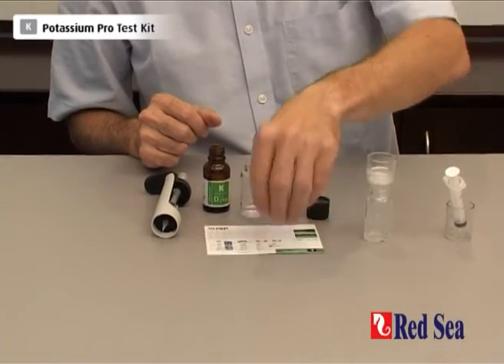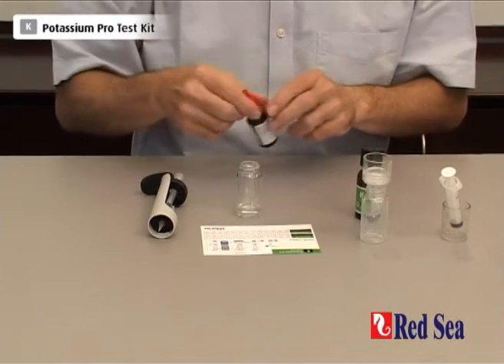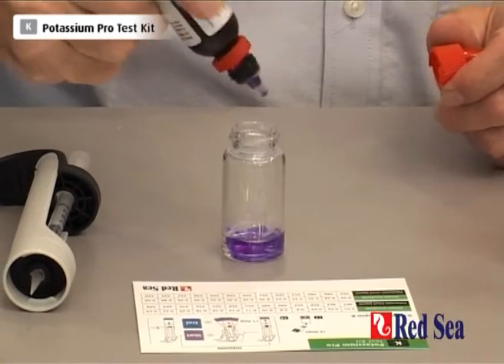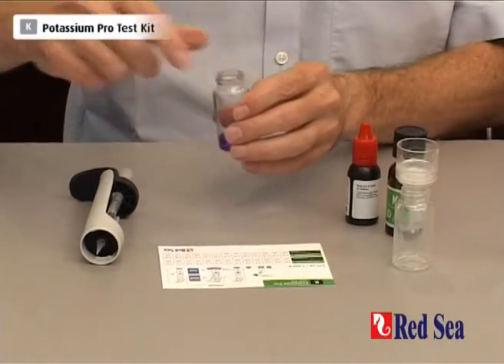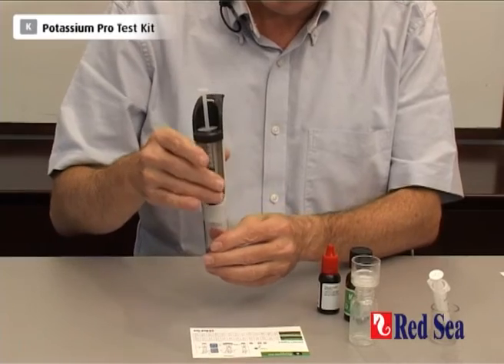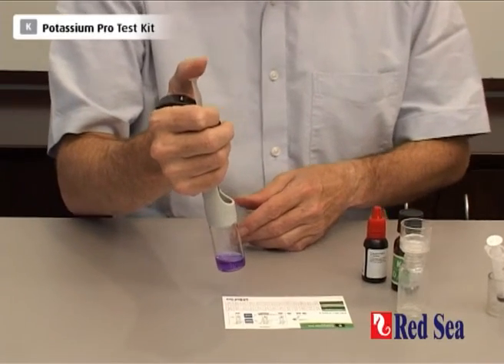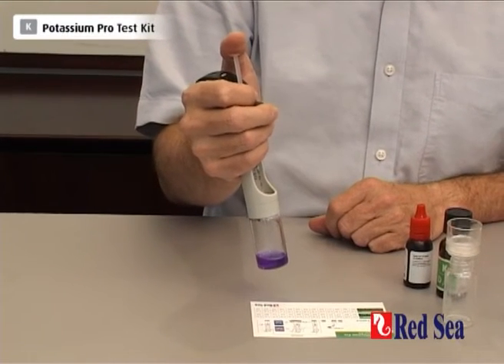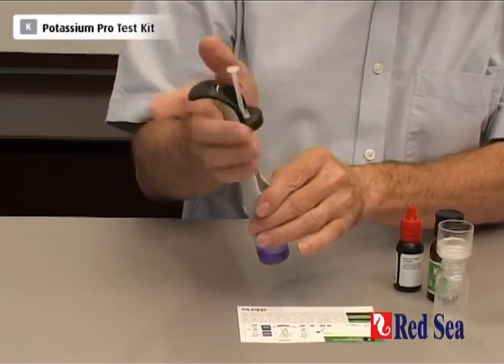We put in 2 drops of reagent C: 1, 2. Shake it — we get this nice purple color. And we're going to add titrant until we get blue. Now unlike most titration tests where more titrant equals a higher proportion of the element, in this one it's the other way around. So we're looking at the less titrant we add, the more potassium we have. So we must add drop by drop right from the very beginning.